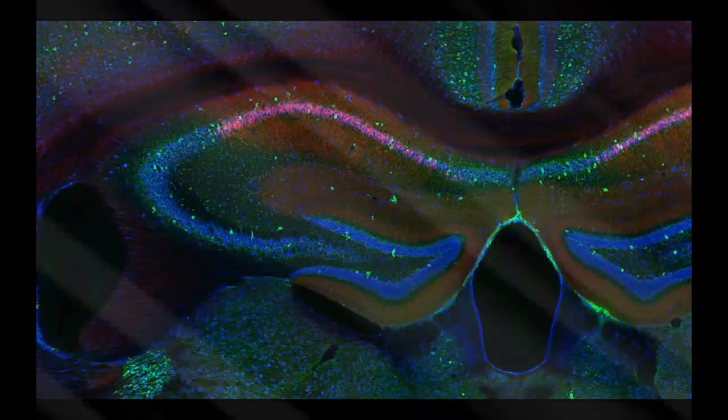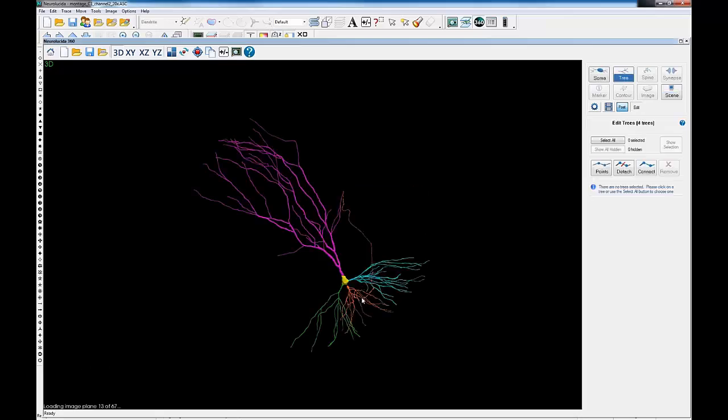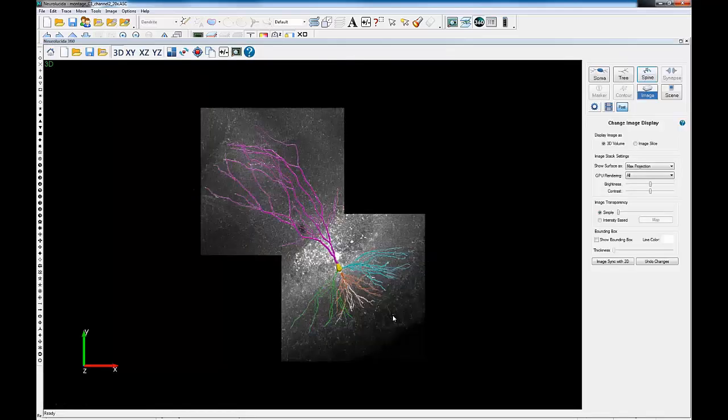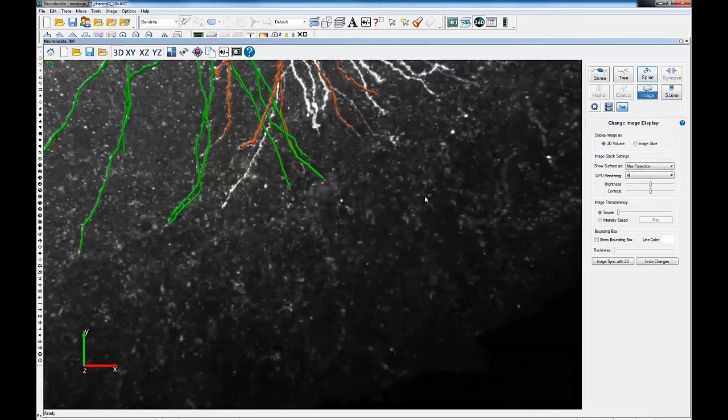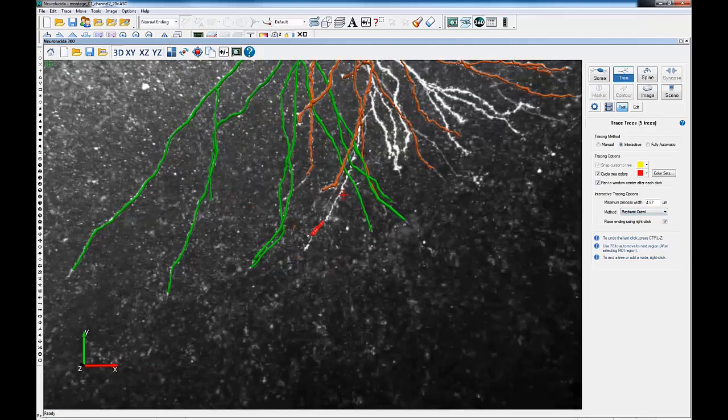So one last thing, I guess. Marcel and Lynette would like to know a little bit more about what you do for your cell fills. Marcel wants to know what streptavidin dye you prefer, and Lynette wants to know what magnification you use. I'll answer Lynette first. When we do the cellular injections, you have to use a fixed stage microscope. If your stage is moving, you're going to break your tip every time. So we want a fixed stage microscope where your objectives move up and down.